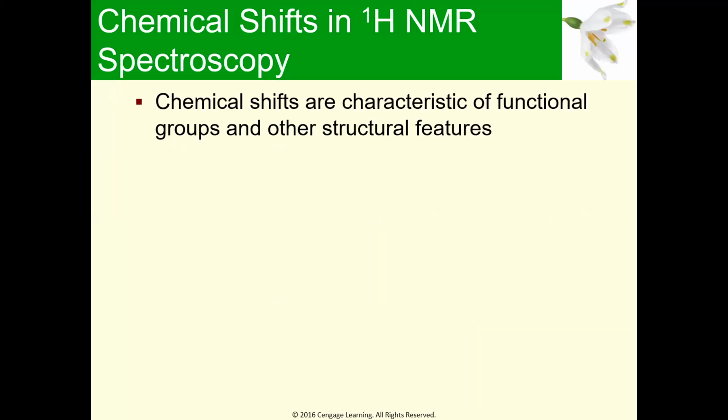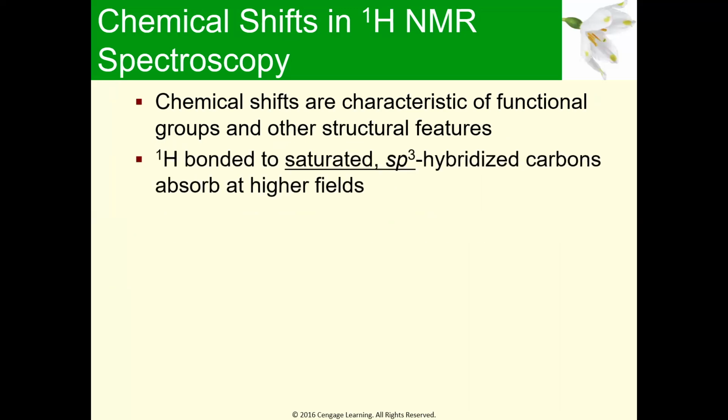Okay, so again, the importance of the chemical shifts is that they are characteristic of the functional groups and other structural features. Now, what do I mean by that? Well, if it's a hydrogen that's bound to an sp3 carbon, a saturated sp3 hybridized carbon, those are going to absorb and they're going to give us a signal upfield. So hydrogens that are connected to a tetrahedral carbon, we expect to see upfield.